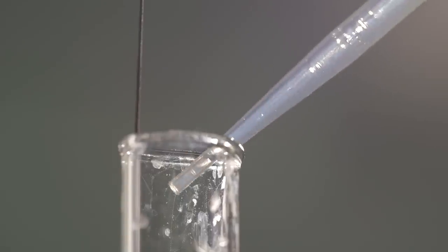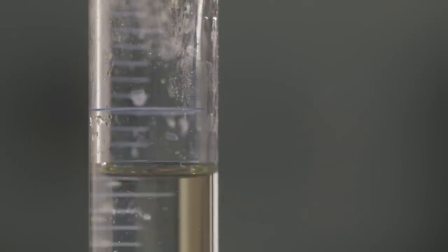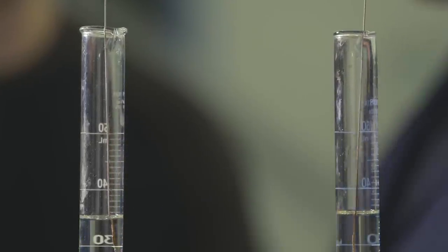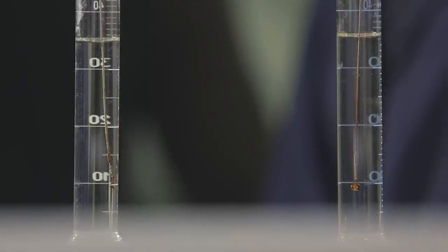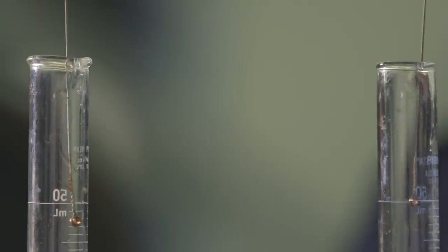This is the artificial perspiration. I'm keeping it at the same level as it evaporates over the cycle of the test. This test frame is automated. It goes down for a submersion of five minutes, then automatically kicks back up and sits in the air for 30 minutes, then the cycle continues.